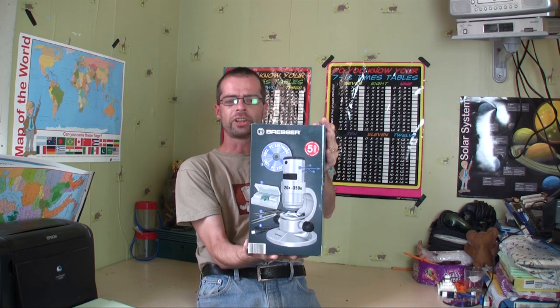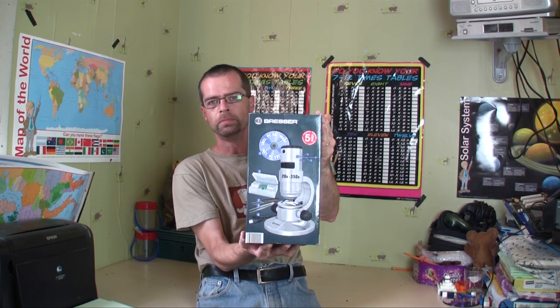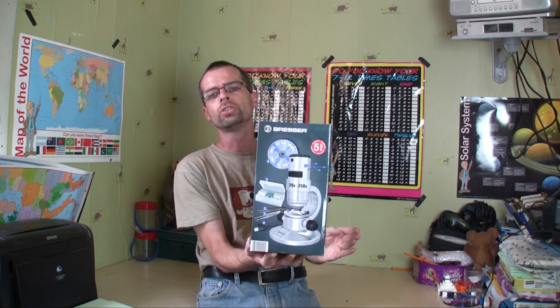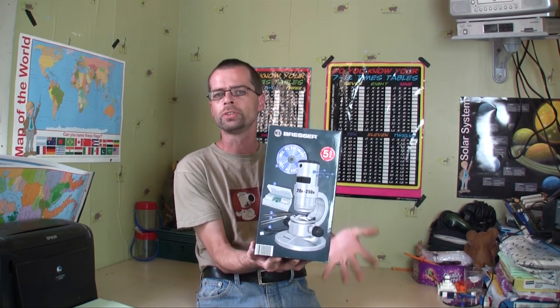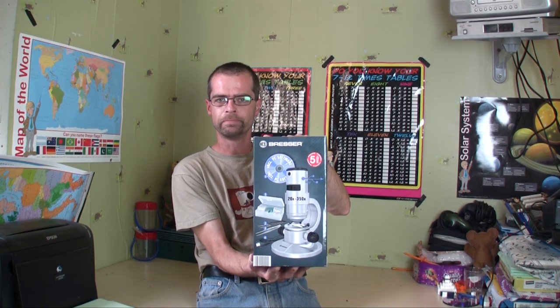Hey guys, I thought I'd do another unboxing video today and a bit of a review as well. I'm going to be looking at this today — it's the Bresser USB Digital Microscope. You can get these for around £30 to £50; this one was £29.99. Basically, it's a microscope that plugs straight into your computer or laptop so you can look at things close up.